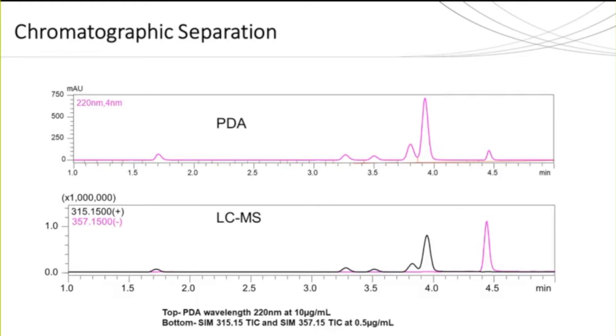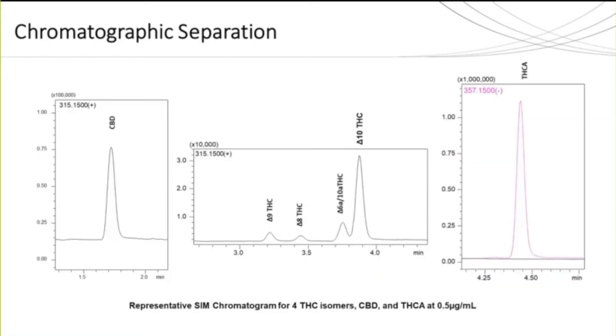Here we are demonstrating the separation of each isomer using LC-PDA and a single quad. The top chromatogram is from the PDA at 220 nanometers; the bottom chromatogram is from the single quad. The black trace is for a SIM event monitoring a mass-to-charge of 315 in positive mode, and the pink trace is for a SIM event monitoring mass-to-charge 357 in negative mode. Not shown is the SIM event monitoring mass-to-charge 317 in positive mode, used for the internal standard. Looking closer, we can see distinct baseline separation between delta-8 and delta-9 THC, as well as sufficient resolution between delta-10 and delta-6a-10a.